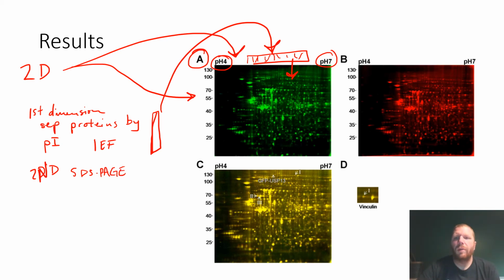Now this is an extremely powerful technique because you're able to do these huge evaluations. You're not looking at one or two proteins. Instead, you're looking at basically an entire proteome. And you can use software that analyzes these Cy3 and Cy5 signals and overlays them. When we compare image A and image B, we get C. And I mean, heck, those look like a Jackson Pollock painting to me, and I'm not an art person. I can't make too much of that.